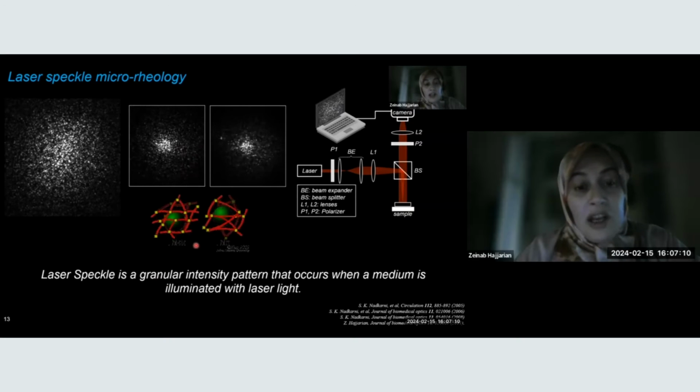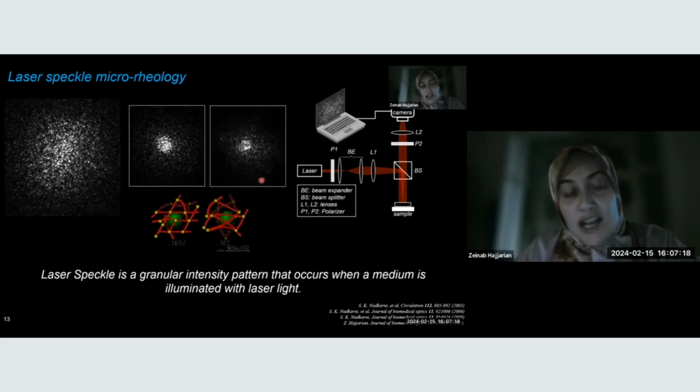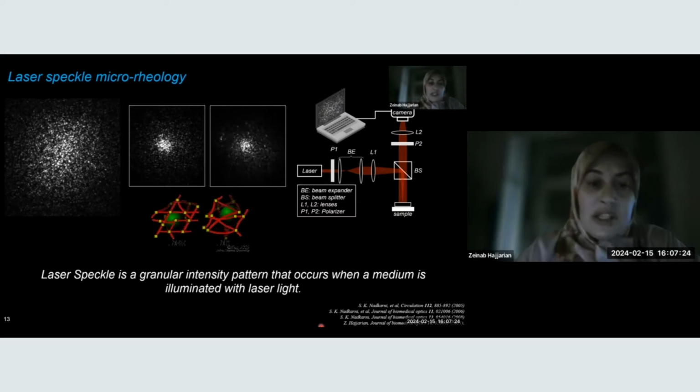If we are equipped with enough of a speed acquisition mechanism through a high-speed camera, we can capture these speckle fluctuations, and by quantifying the rate of speckle fluctuations, get at least a sense of how stiff or soft the underlying material is.